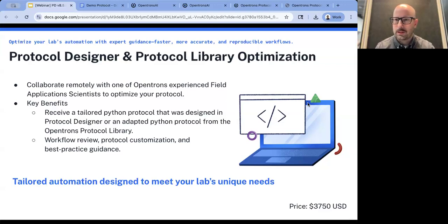I think that's all the questions. Thanks so much for sitting through this. We have 1 minute left, so we made it. Okay, one last question. Any plan to update the Opentrons app in the future to accept any input? Well, let's follow up afterward. I'm not sure, Davide, what you mean there, but we can maybe go in a little depth afterwards.